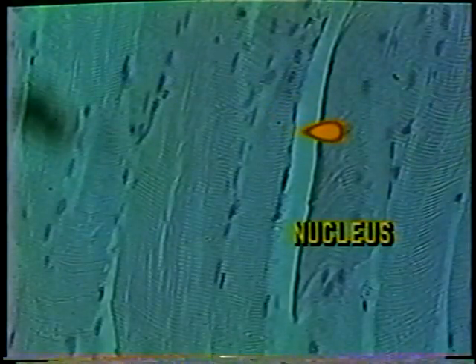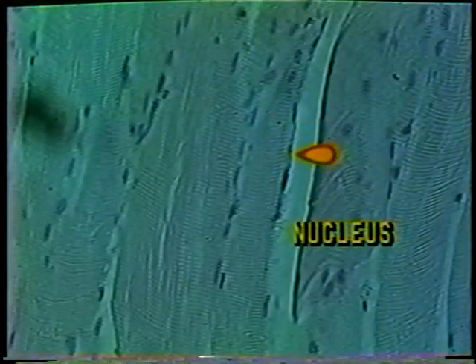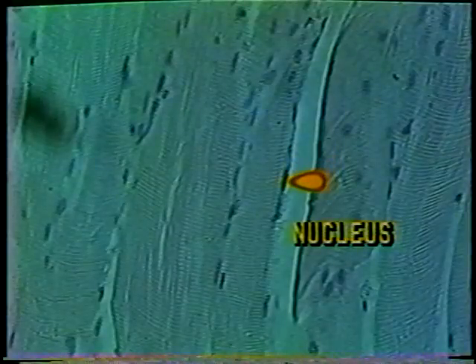Skeletal muscle cells are long threads that extend the entire length of the muscle. Thus, each cell is often referred to as a fiber. Skeletal muscle cells are multinucleated, and each nucleus is located near the border or edge of the cell, as seen in this slide.